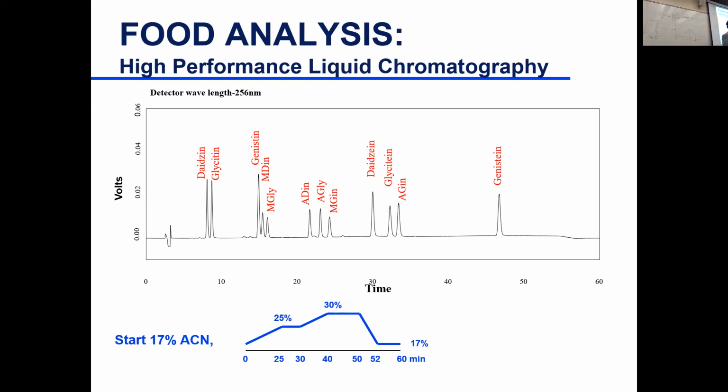So you want to keep it at 25? This will take even longer because it is the least polar, right? So if you don't give it organic solvent, it won't want to come out. You want to give it, so what would you do? Madison: Instead of just staying at 30%, what I would do is go, okay, where does this compound come out?